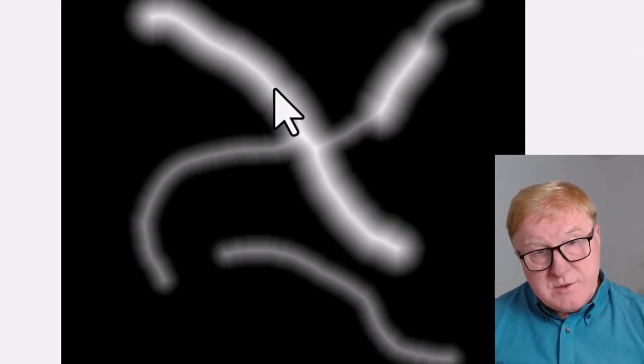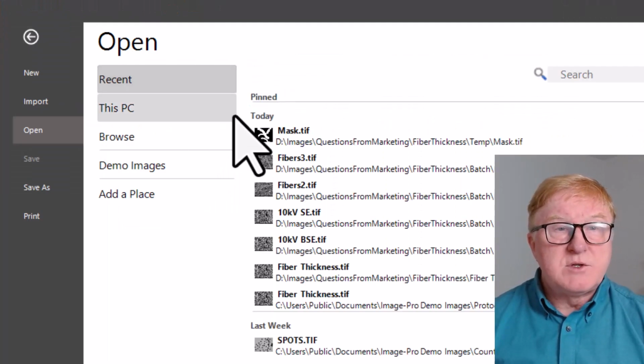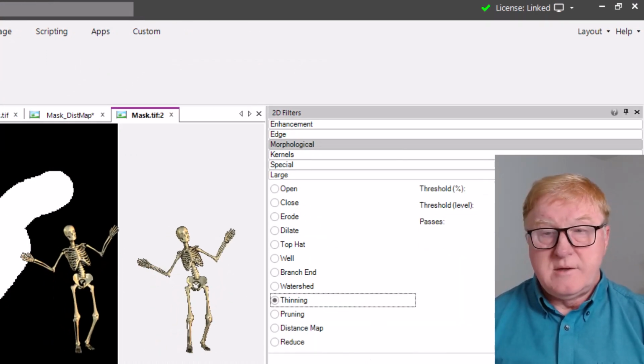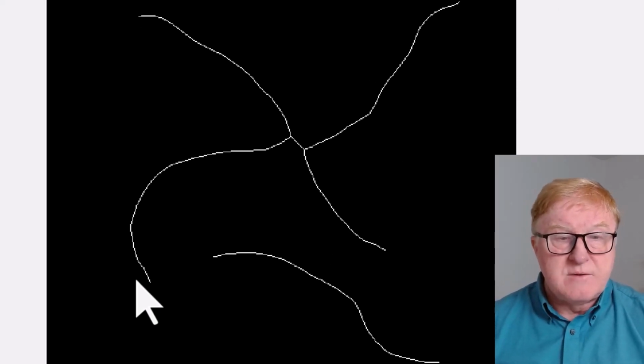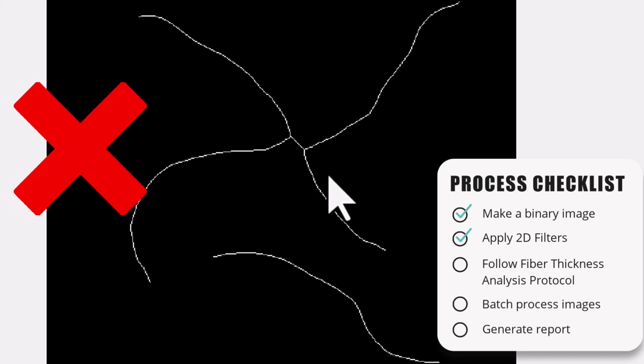We also need to detect this middle line where the thickness will be measured. The middle line can be measured using the skeleton operation, thinning. We apply thinning, we get the middle line, we have the distance map, we measure intensities. So then we just go through this skeleton line with a certain interval and measure intensities at every pixel. We exclude crossing points, because crossing points typically would be the areas where we don't want to measure thickness. We want to exclude them.